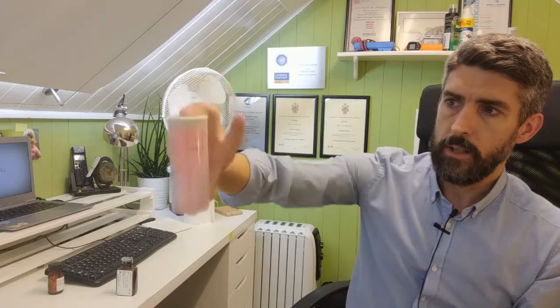And what you don't want to do is tap out directly into the sample, because a few will come out and you'll lose count of how many actually came out. So tap them out into the cap and then transfer from there into the actual sample. Don't touch the tablets with your fingers because you will affect the end result. So that's 2 tablets that have gone in there now, and it's still staying that pink colour. So we continue. This will be tablet number 3 going in now.